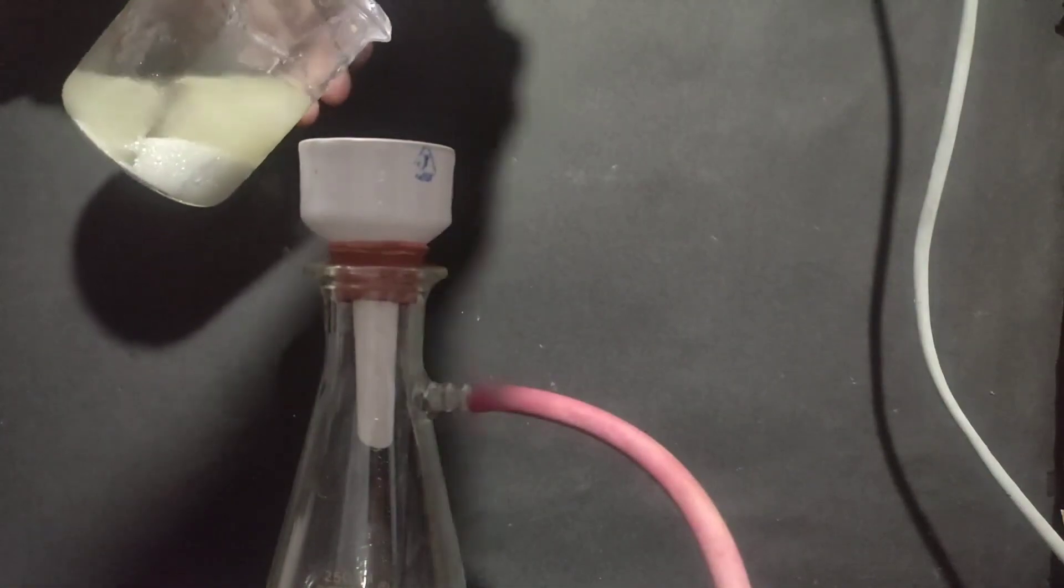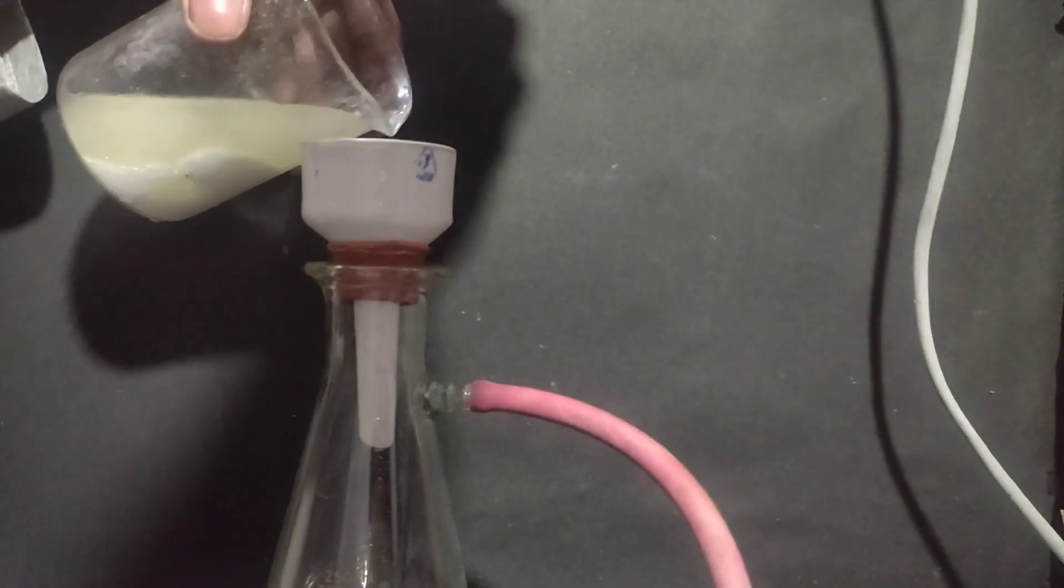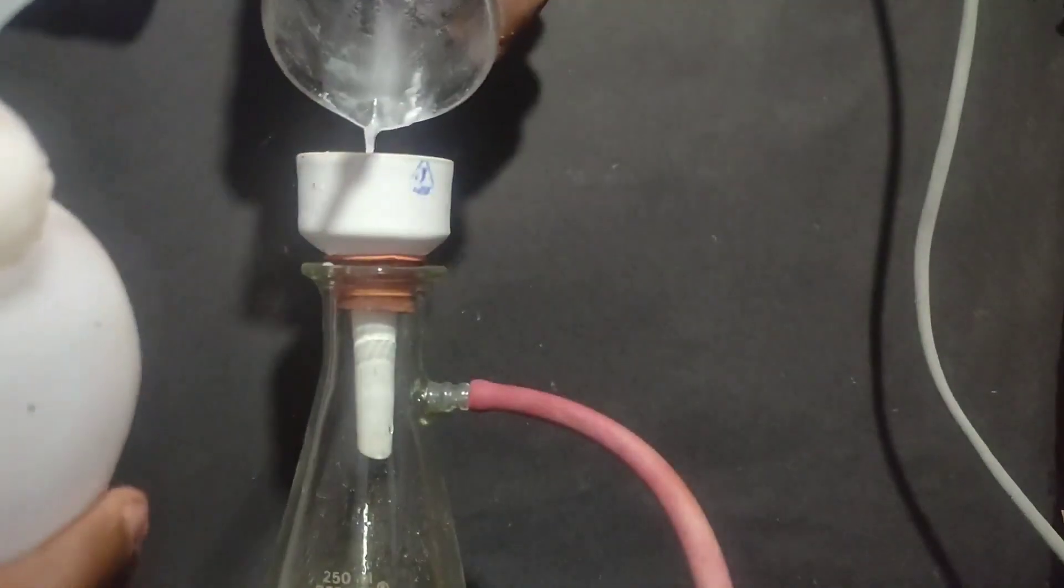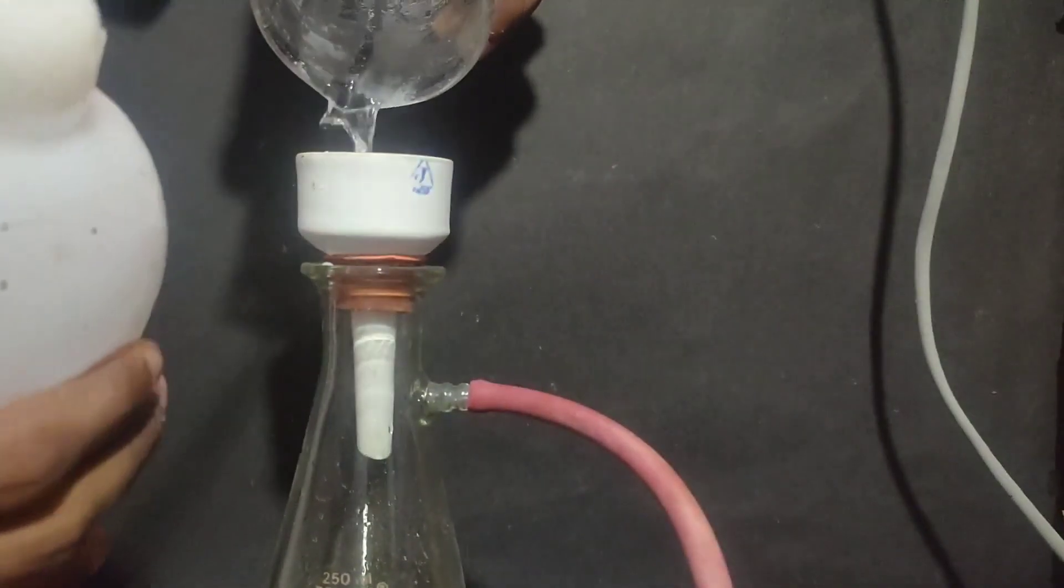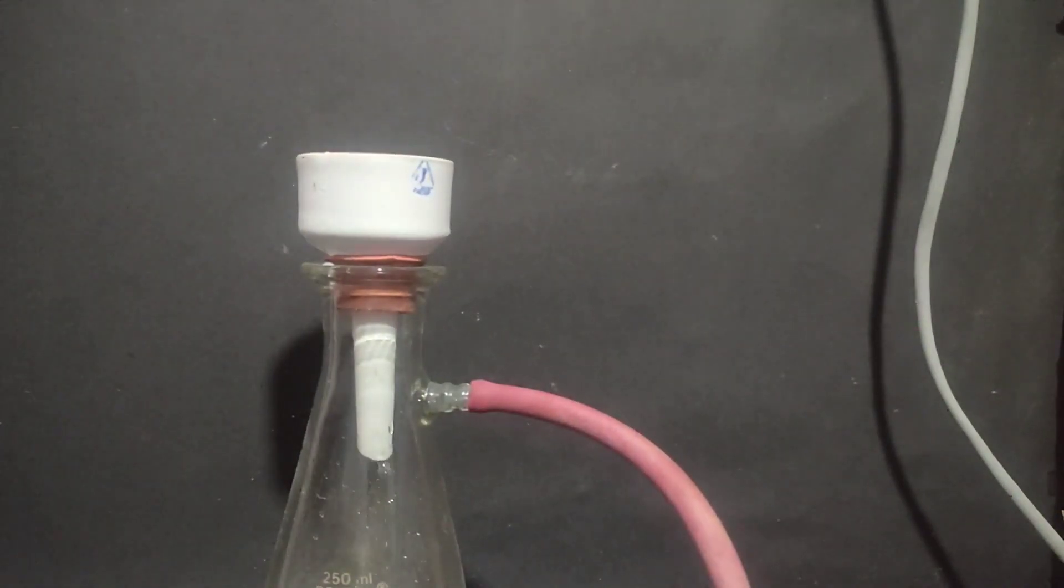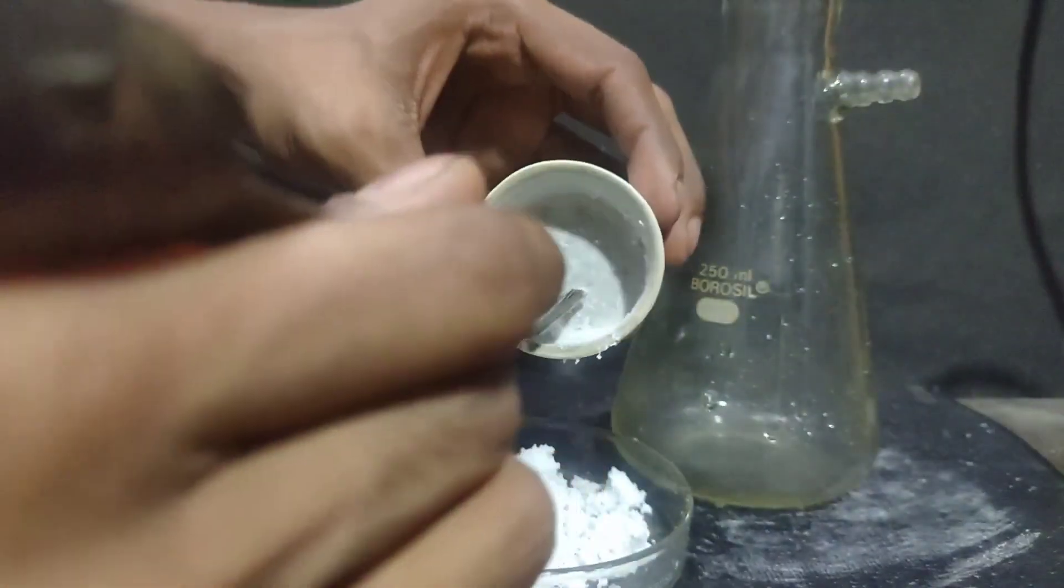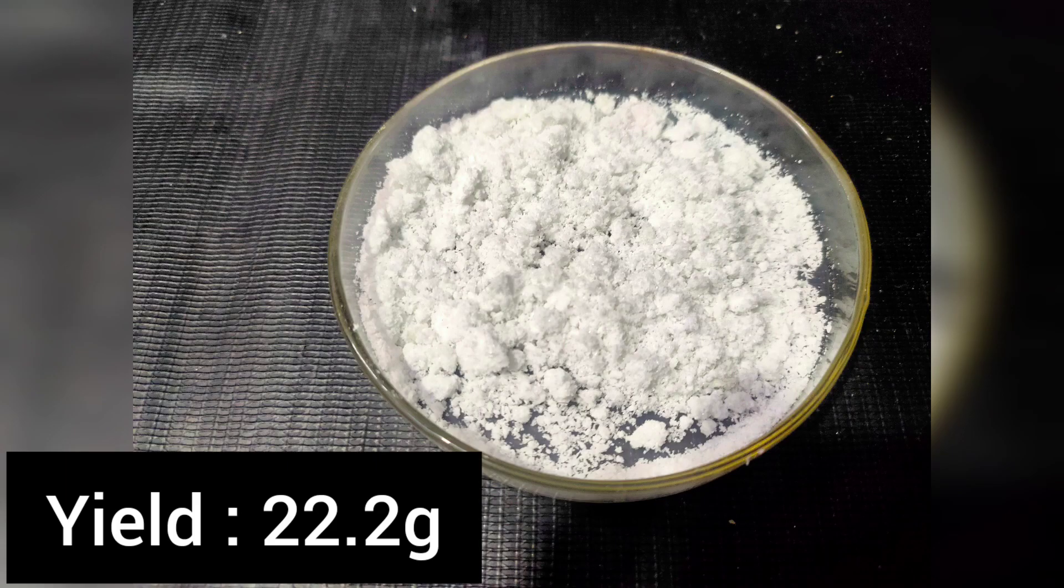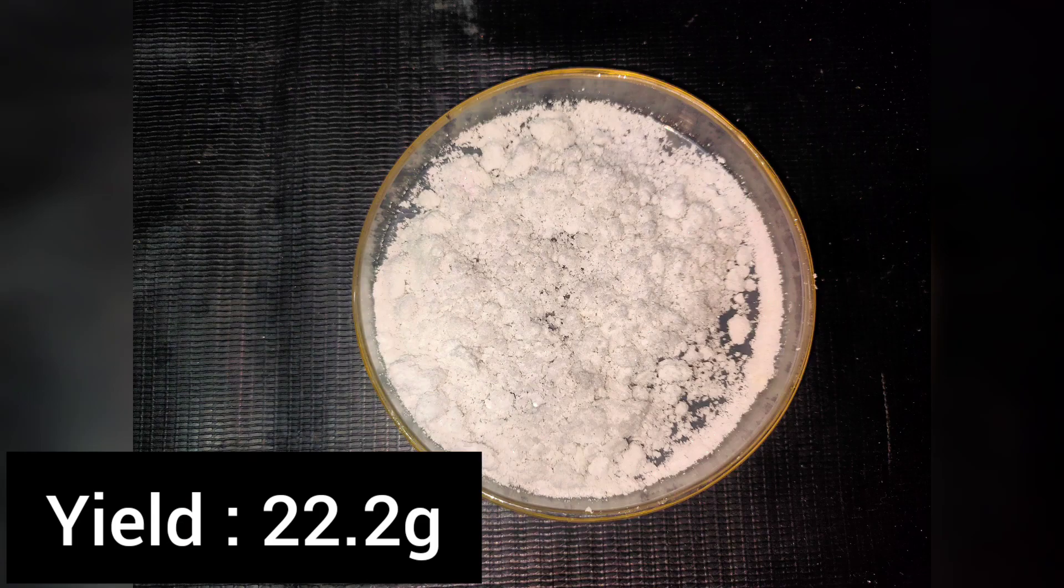So on cooling the solution inside the freezer, these are the crystals of potassium bromate formed and I filtered them using a buchner funnel on vacuum filtration. The beaker and the precipitate was washed with cold distilled water. The crystals were transferred onto a petri dish and they were dried in a desiccator. The yield of the crystals after drying came around 22.2 grams.